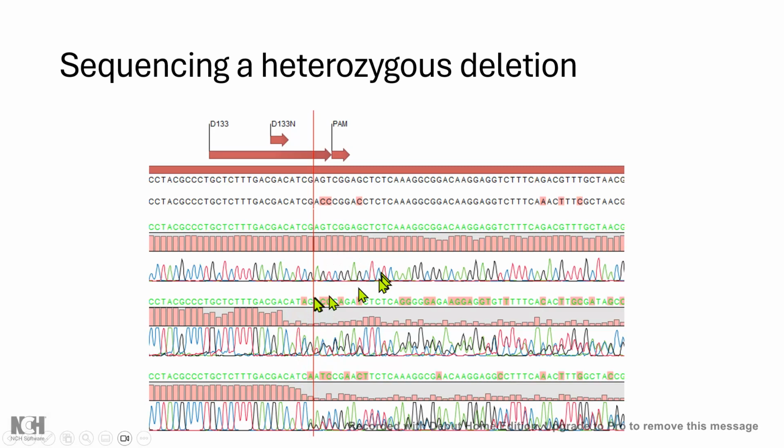If you look very closely, you can see actually some bases were lost here and here. But hindsight is 20/20. Point is, Chroma is great, but the software just completely falls to bits because you're effectively listening to two different voices at the same time. And with 4 different colors on top of that, it just becomes a jumble. And how on earth are you going to comprehend that?